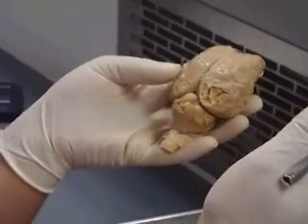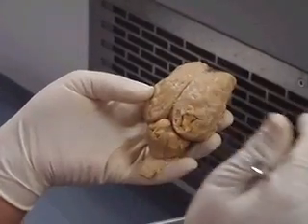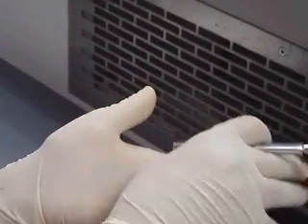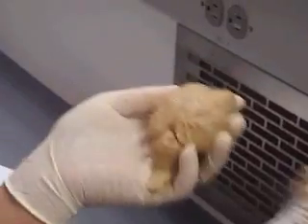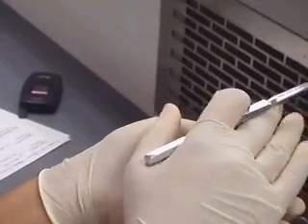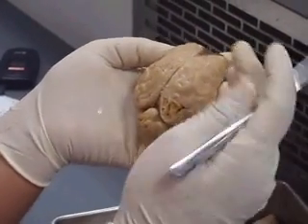The brain has 3 meningeal layers, layers of tissue going over it. The first one is the thick dura mater, which is not here. It's this big jacket that goes over it. So if you see a big, thick coat over one of these, or it's pinned, you know that's the dura mater. I'll try and find one and show it to the class before the end of the day.